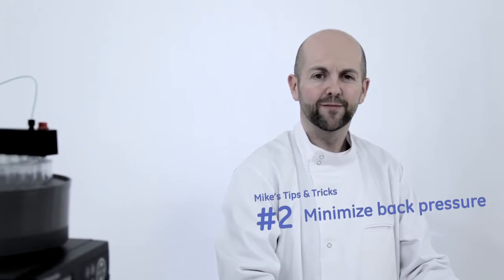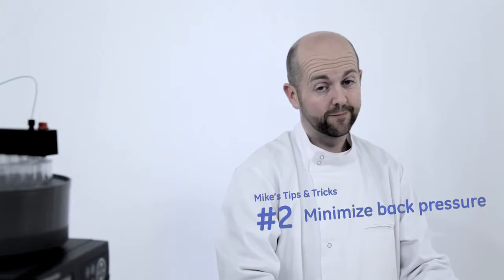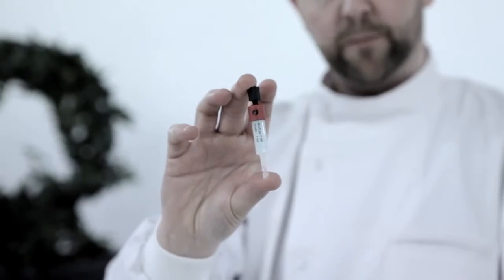Mike's second tip, changing flow rate and viscosity can minimize increased back pressure and the risk of a clogged column. Well, I load up to 100 mils on the 1 mil column and up to 500 mils on the 5 mil column, depending on the sample viscosity and cell debris. What is important is to avoid the ultimate consequence of increased back pressure, a clogged column.